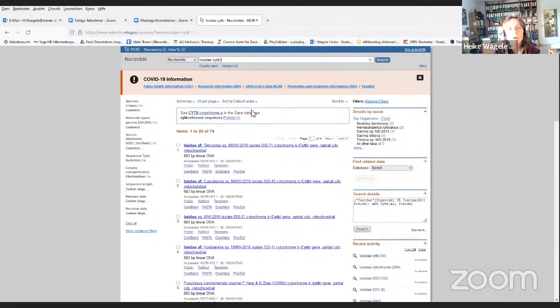Yeah. If you want to work on the phylogeny in a way, you could also download cytochrome B and concatenate it with CO1. You have your sequence as CO1, and hopefully the CO1 of your sequence has enough information to attach it to the correct CO1 sequences of the group you want, where it is in there. And the cytochrome B then also helps you in the phylogeny, who is more related to what. Yeah, that would be a way how to do it. But as I said, cytochrome, let's put it cytochrome.